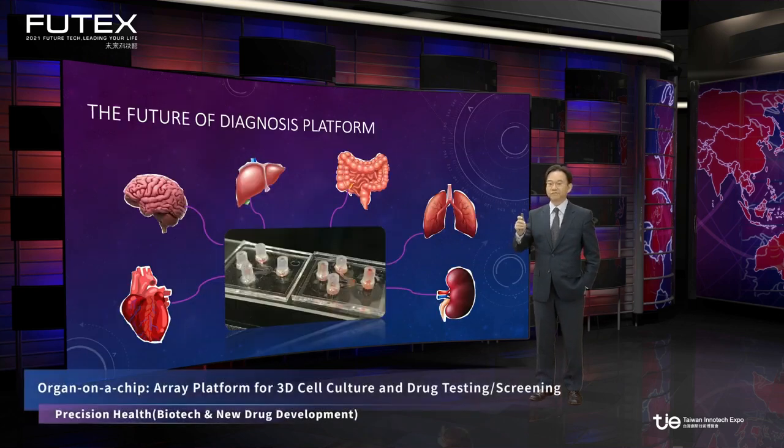There is a surge of need in organ-on-a-chip devices because of their capability in rapidly analyzing biomedical, metabolic, and genetic phenotypes ex vivo. Nowadays, the demand for organ-on-a-chip in drug screening has increased, especially in personalized health care.